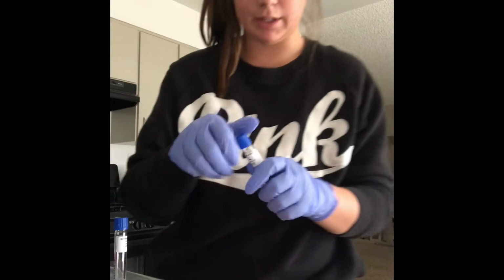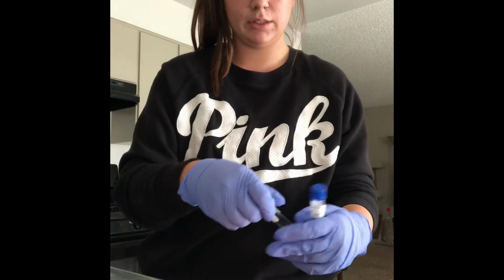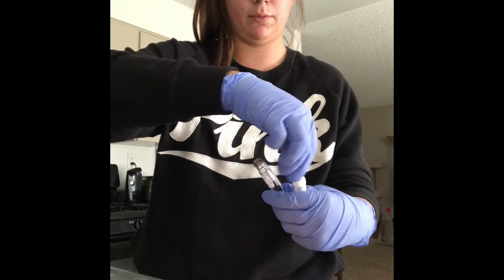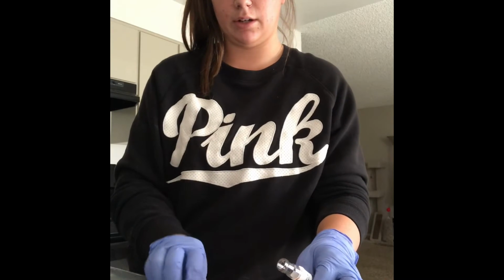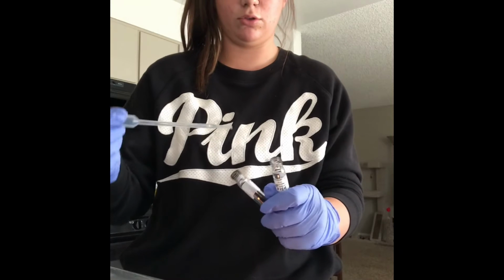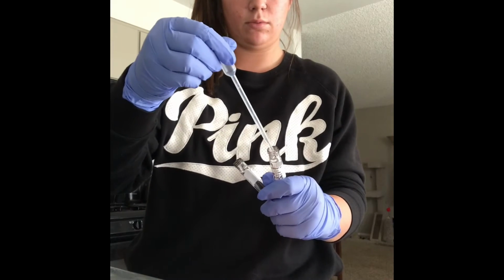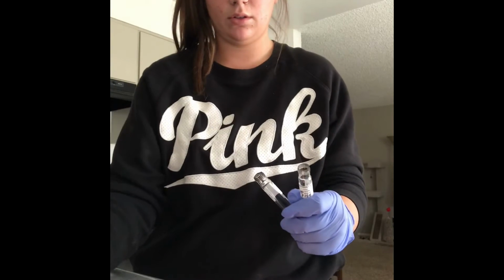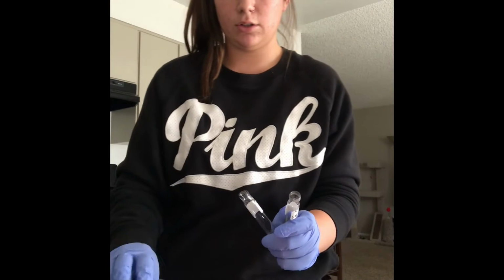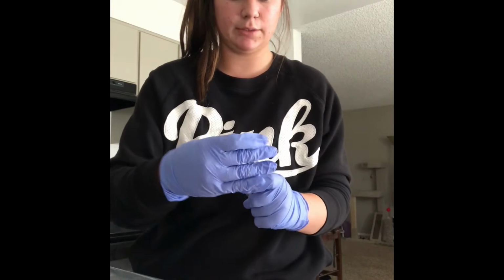And now I just have my S-epi pH of 9. Same exact thing, just going to remove the lid, sterilize and sterilize, and place 2 drops. 1, 2. Sterilize and sterilize. So that's S-epi all done for my pHs.